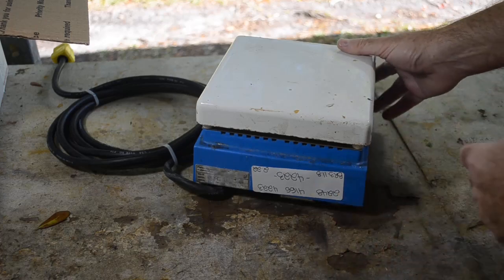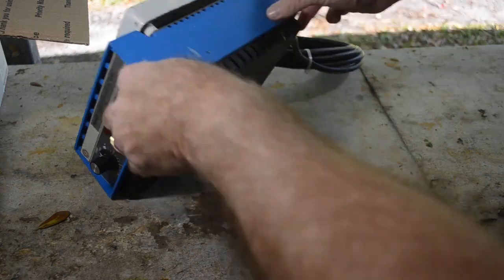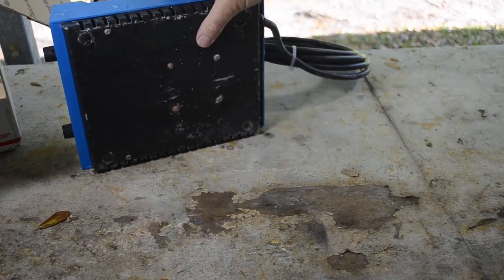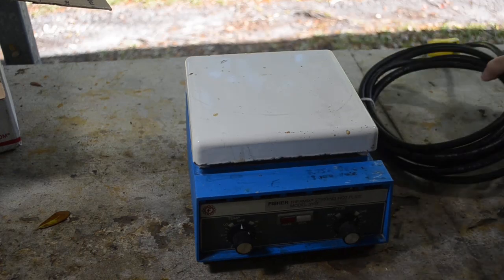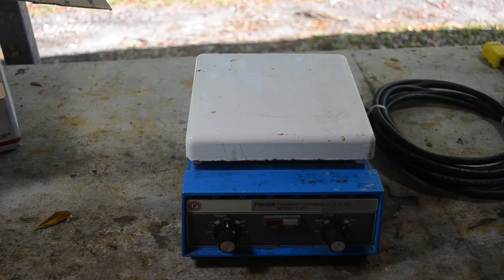It's been well loved, that's for sure. Somebody else got the best years of its life, I think. But yeah, it's missing some feet. I may have to put some feet on it so it'll sit level. It kind of rocks — that's not going to be good with liquid on it. So I'll put some rubber feet on it and cut the wire ties off the cord, and we'll give it a test and see how well it actually works.